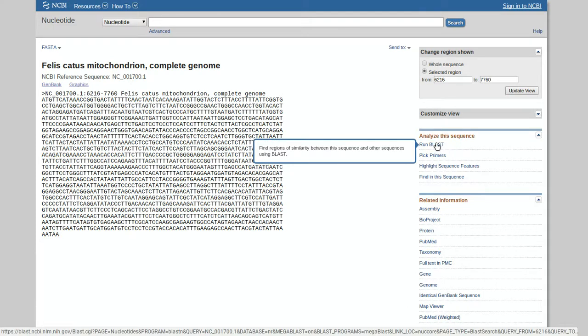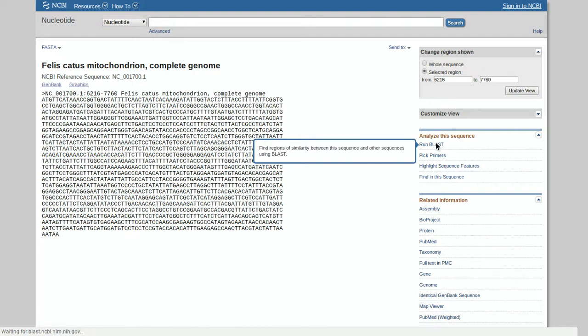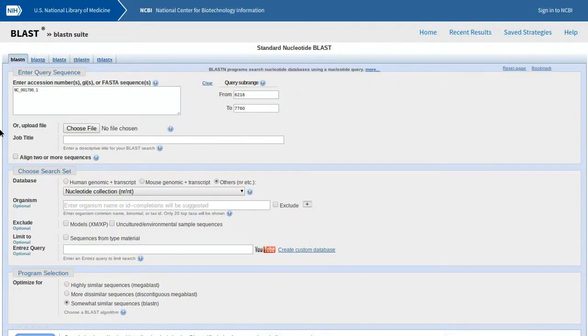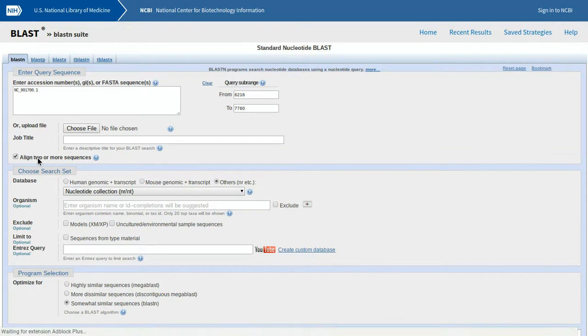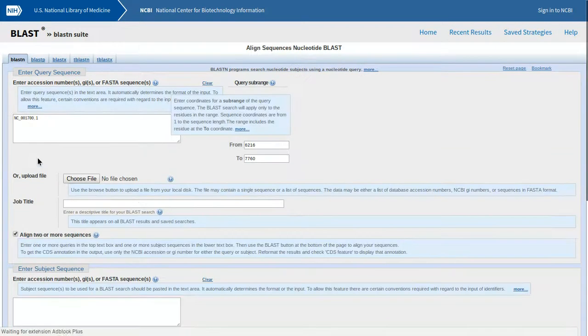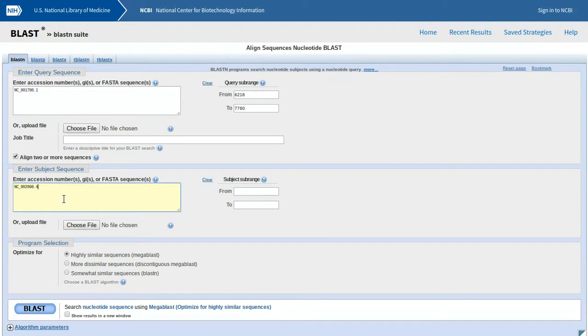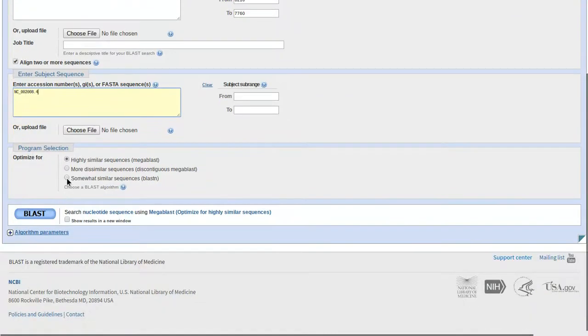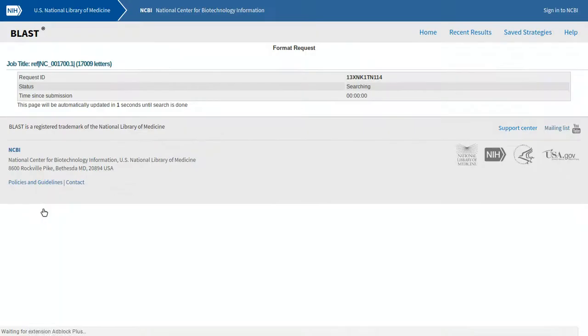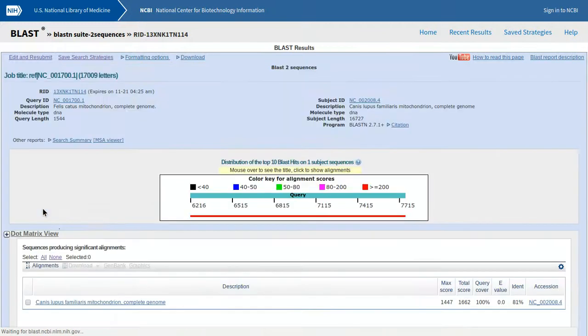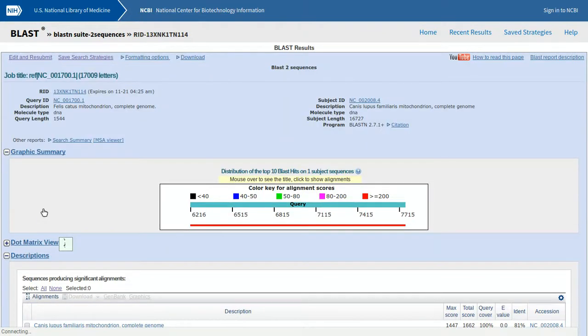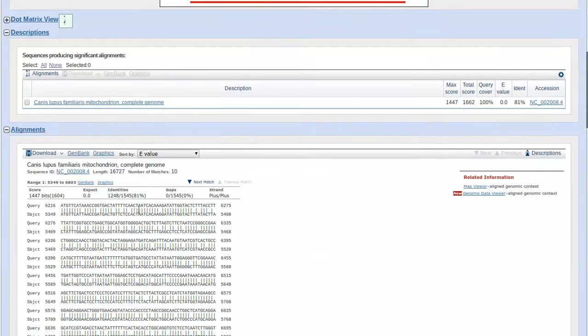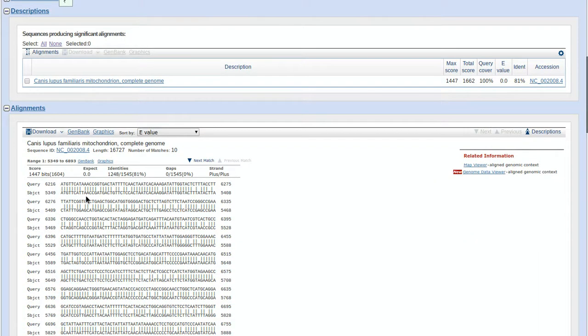which is underneath analyze the sequence, it automatically puts a code into the sequence, the number sequence. Now we're going to click align two or more sequences. After you do this, just paste the code you copied, somewhat similar. Now we're going to BLAST it. This shouldn't take that long. It didn't take long at all.